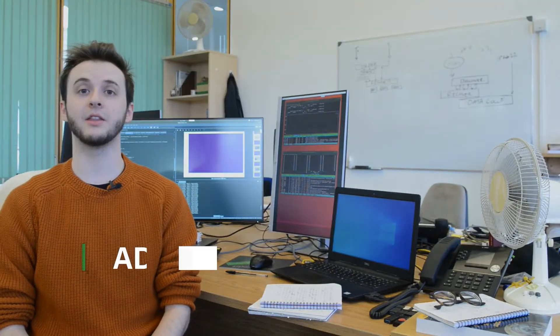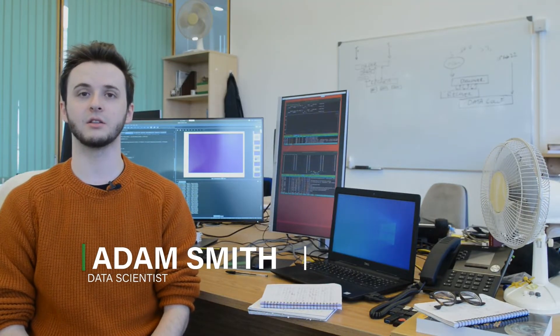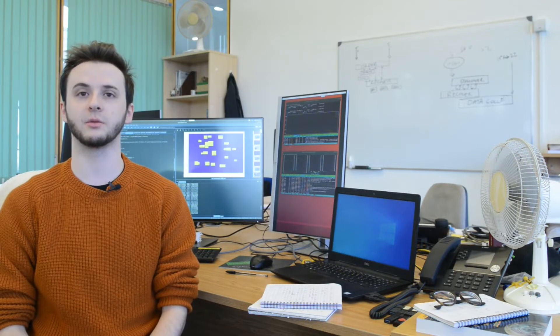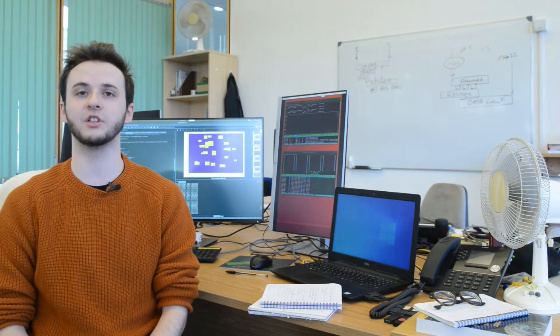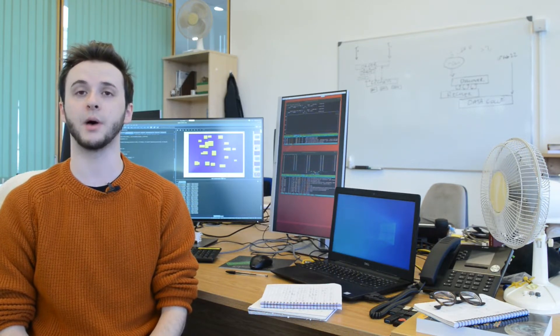The AI assist in the ARRI unit is designed to help find relevant sites on substrate evidence. It's looking for any region which has enough ridge detail that it might be useful to you, be this full fingerprints or partial prints from a palm.